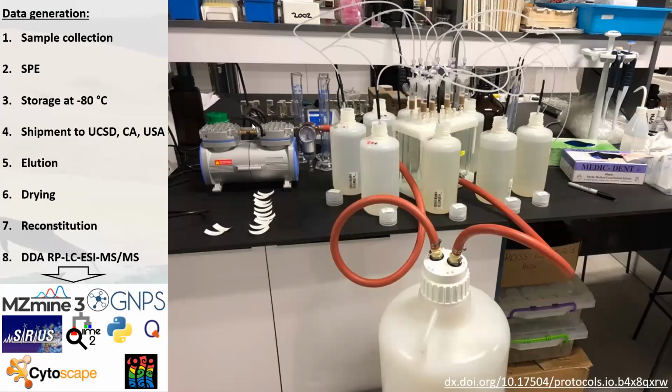All right, and how it worked is, so we went out, I was a little bit involved there, and we collected water samples in these plastic bottles. So all it really involves is putting a nitrile glove on and dipping them into the water. So we collected surface water. Then right after collection, they were brought back to the lab and they were subjected to solid phase extraction.